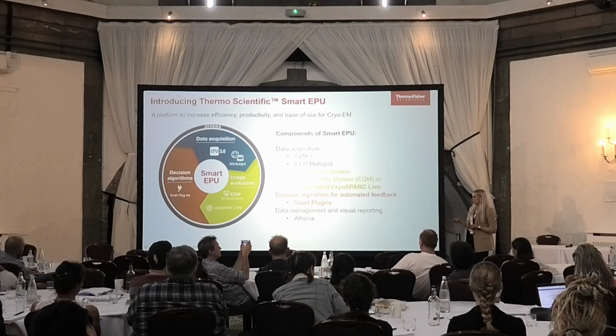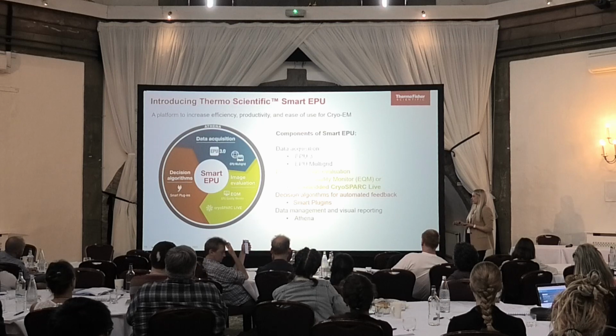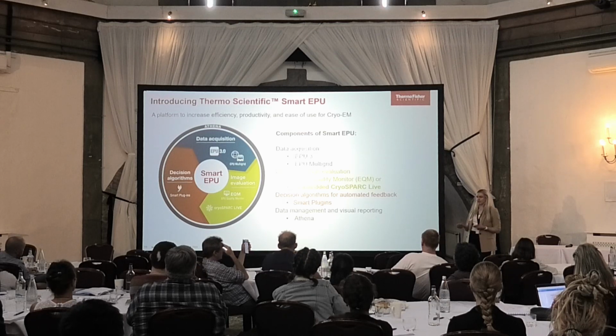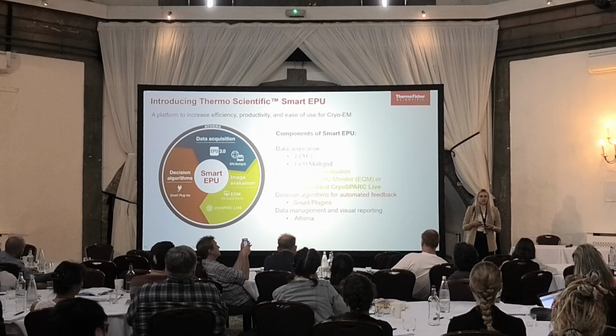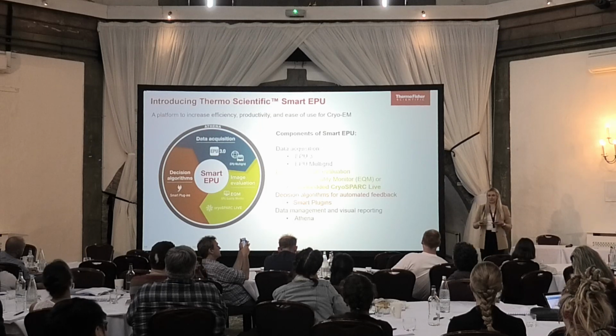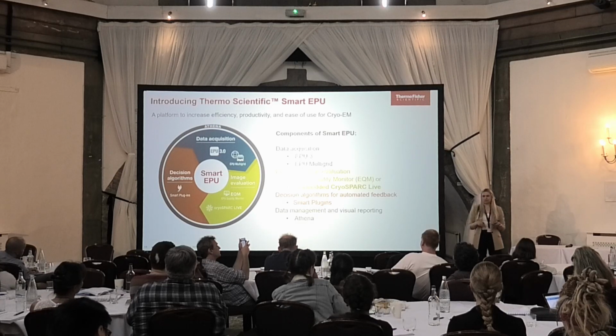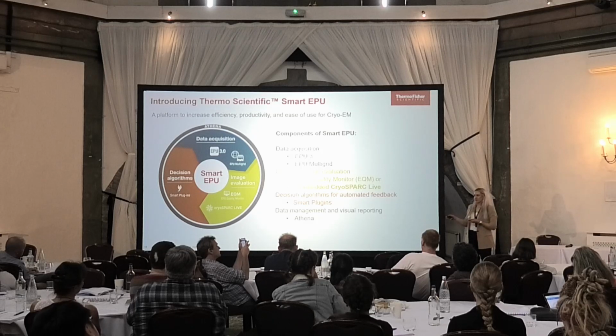But then on top of that, we have this module that you may have if you want to do EPU quality monitor or embedded cryo Spark Live, and that will monitor all data collection on the fly. And then that information can be used for feedback loops, to adjust data collection parameters. So it sounds really simple, but actually it would save a lot of time if people did not have to really monitor data collection. So the computer can decide that that grid square is not worth collecting on, or something happened to the defocus values I need to adjust.